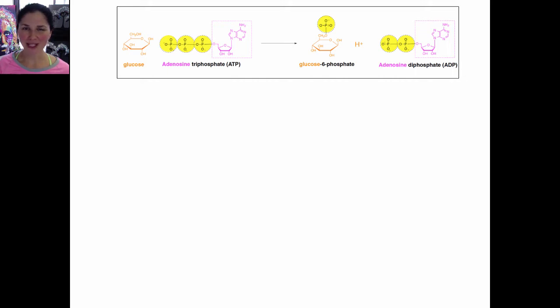This is a pre-lab video on the lab for where is lactose digested. This is a lab that demonstrates the specificity of substrate and the optimal reaction conditions for the enzyme lactase.